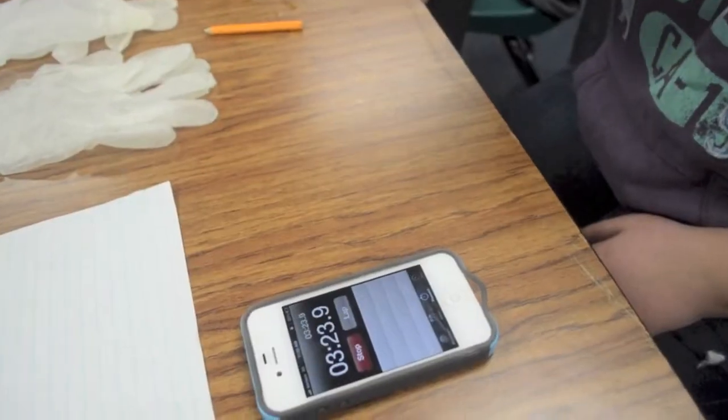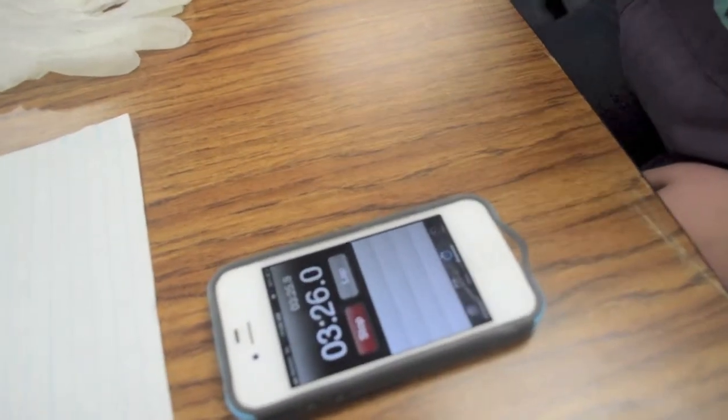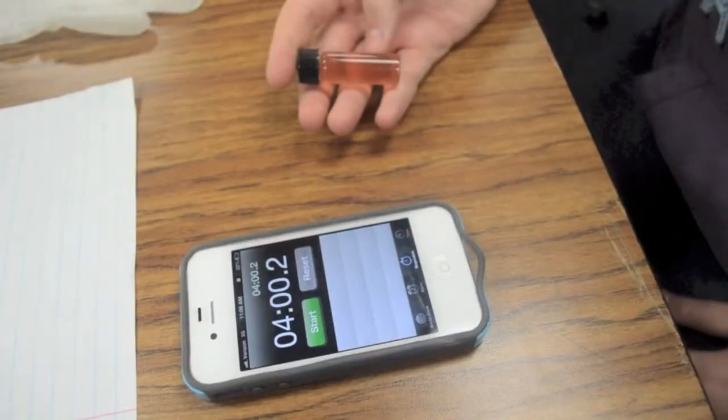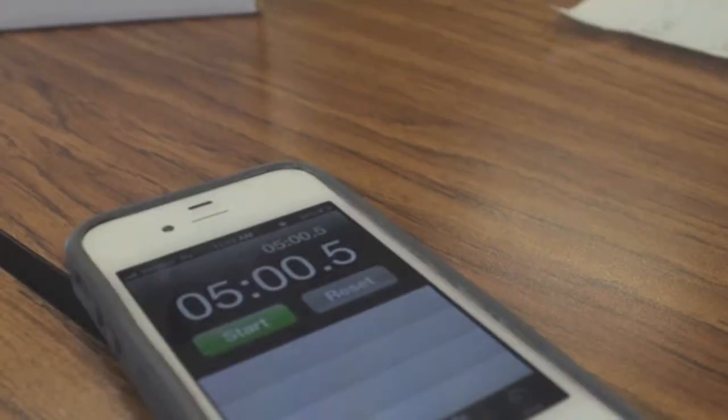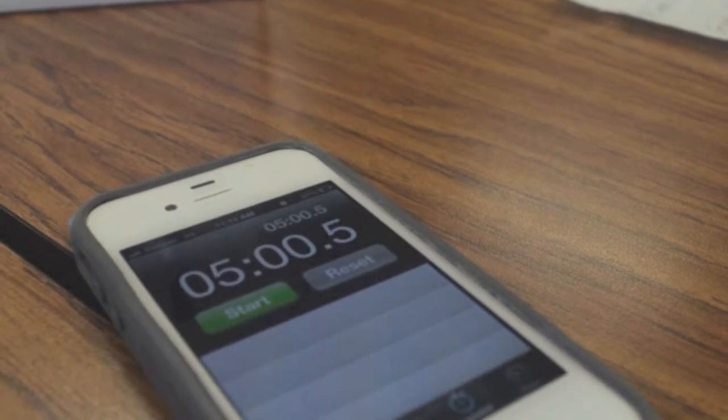Still shaking. Almost done. Done. Now you let it sit for about 5 minutes to let the color set.